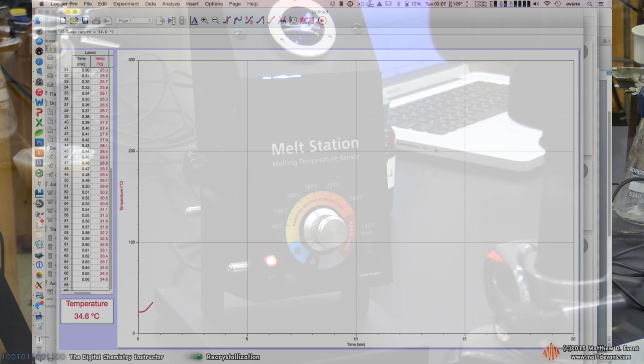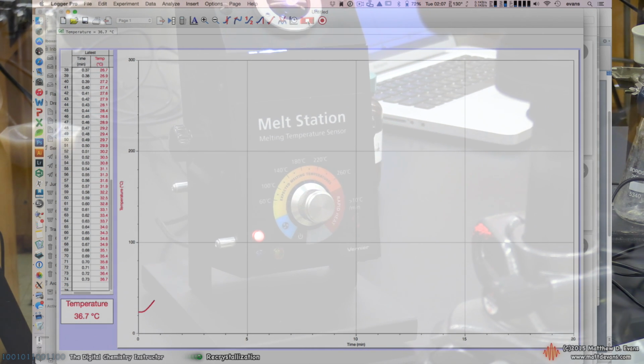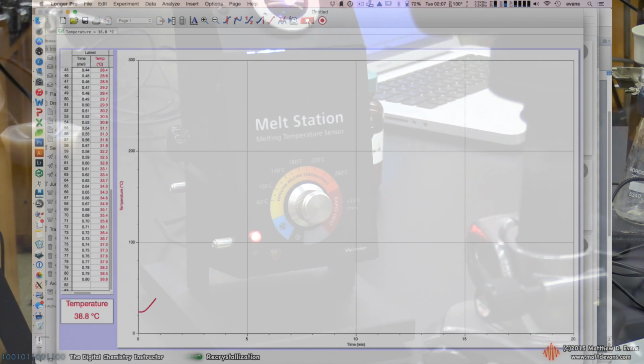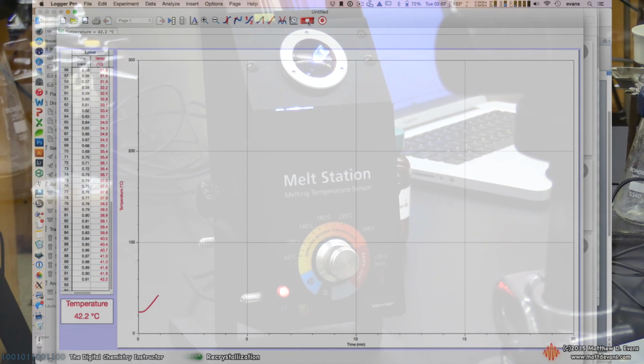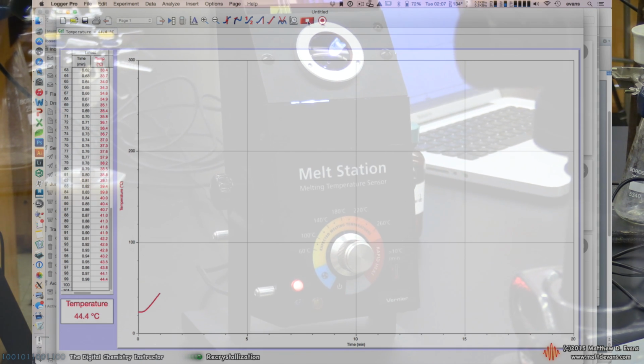Sulfanilamide should melt at 165 to 167. That's the range literature says. My impure, on the other hand, should melt below that. We'll see what happens. I'm taking video of the samples. I'm not sure if it's going to turn out or not, but we'll take a look. Now the middle sample, keep in mind, is going to be the one that melts the earliest. That's what we predict.